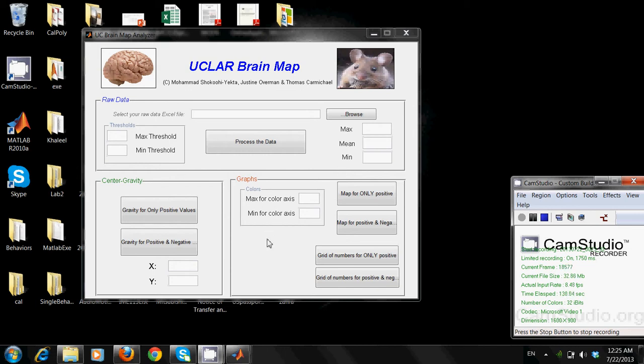You can do it anytime you want. You can just draw the graph immediately without waiting for the pre-processing step, because you do the pre-processing step at the beginning, and then you just go to the other part. So please keep this in mind, that the pre-processing step should be done only once. You don't need to repeat it again. Now, this is how it works.